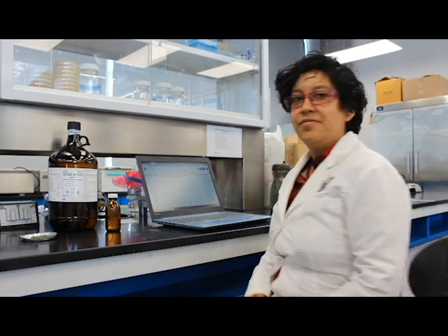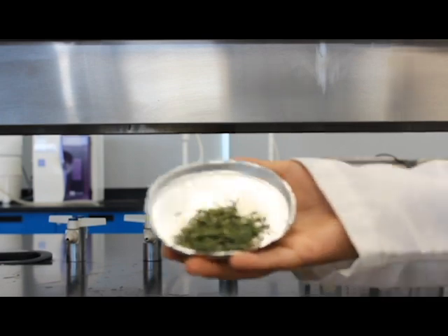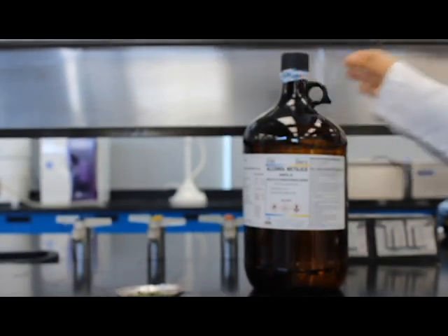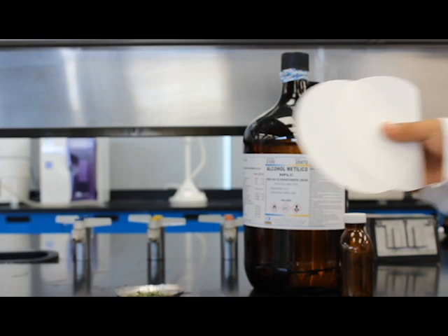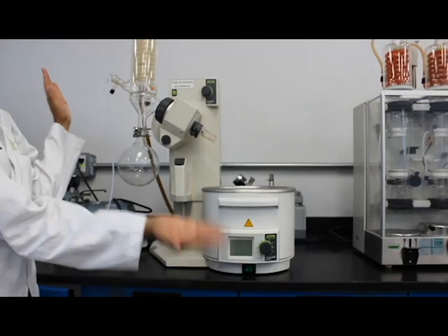Meet Anna, a master's student. Her research is about finding the compound responsible for the hypoglycemic activity of ruta extracts. First, using dried ground leaves, she prepares extracts employing methanol, a polar molecule, as a solvent. After maceration and filtration, the solution is concentrated using a rotary evaporator. And just like that, the extract is ready to be inserted into vials.